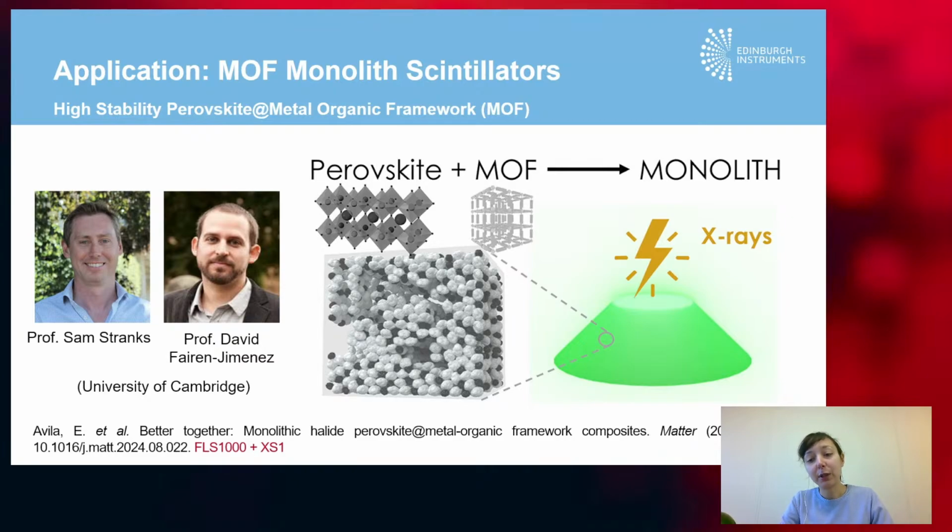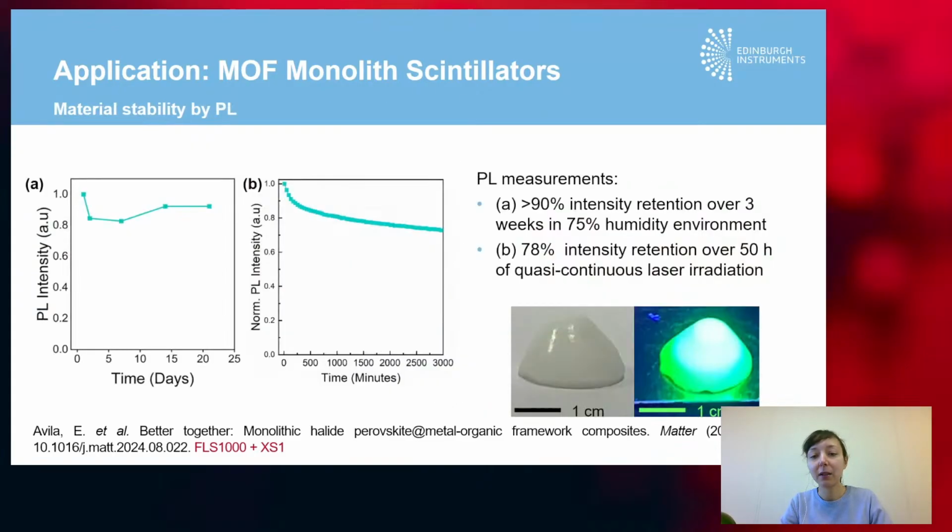In the paper, they used the term monolith, which describes a bulk form of a MOF rather than a polycrystalline powder. It's better for this application as it's more easily handled. It's more robust as well, less prone to damage by moisture. So they did a set of measurements.